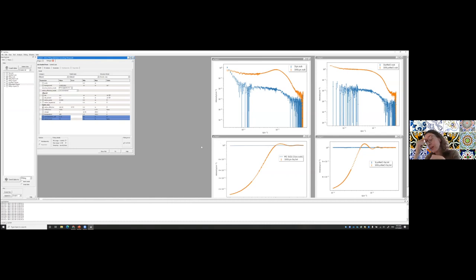I mean, you could just try and see what fits, but then you're kind of blind, and you can be unlucky that you fit your data and it doesn't make physical sense, right? So your model has to make physical sense with what you know about your sample. And again, this was sort of a teaser, so I kind of made you fit something that is not ideal.